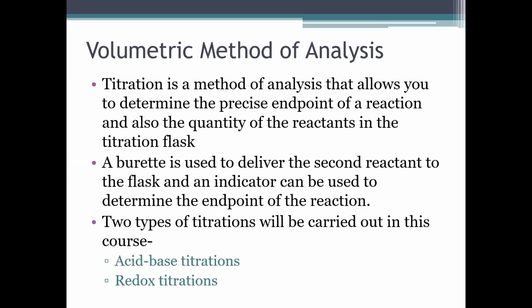Volumetric method of analysis is just the same thing as titration that you were used to when you were in secondary school. And in this course, we'll be carrying out two types of volumetric methods of analysis, the acid-base titration and redox titration.